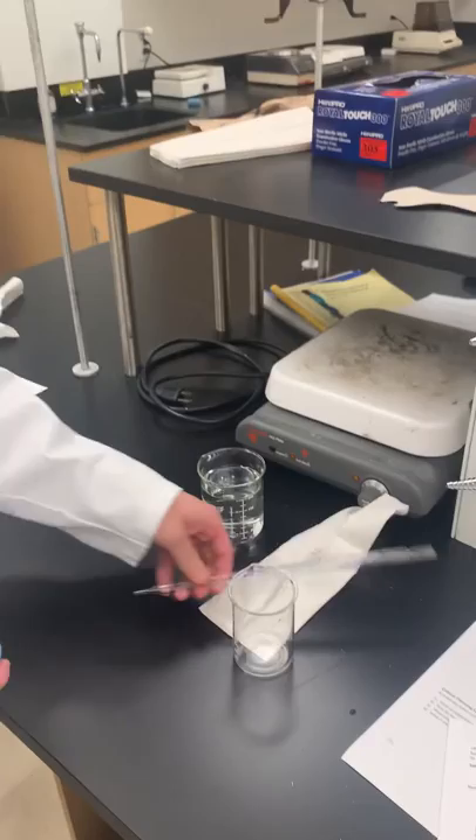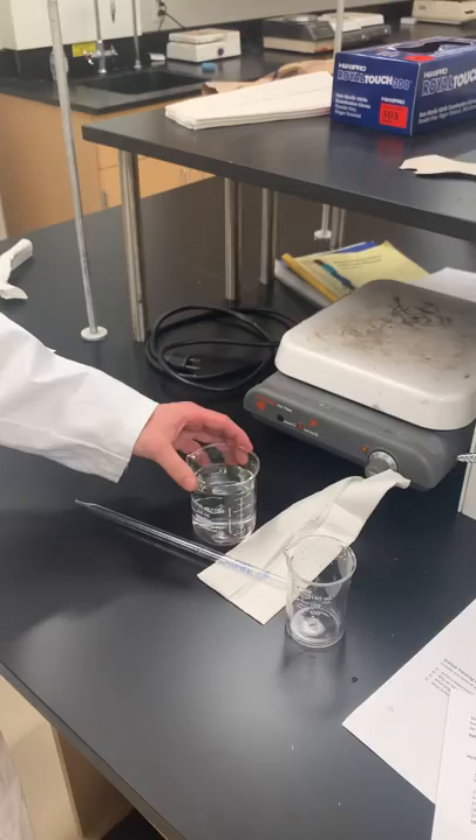So you're going to need a rubber bulb, a graduated pipette, a paper towel, some water or other substance to transfer, and something to transfer it into.